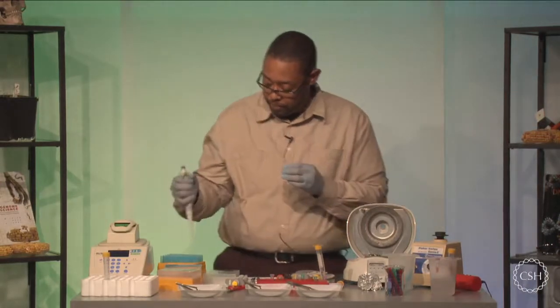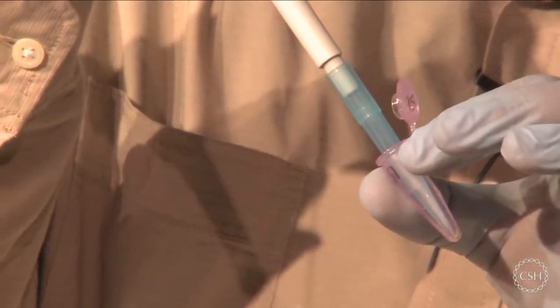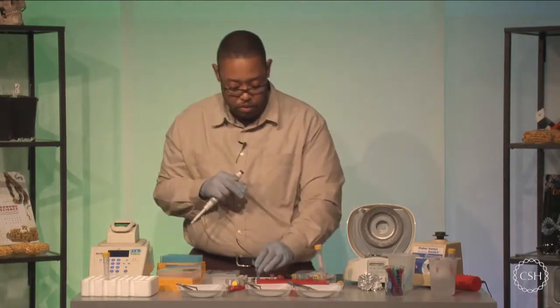So I'm going to open this up and I'm going to take off the wash buffer. I'm going to use my blue pipetter, still set to 500, and that should allow me to take off the majority of the liquid. Remember not to pull up anything that's associated with the pellet. Leave the pellet alone. We don't want to disturb it.